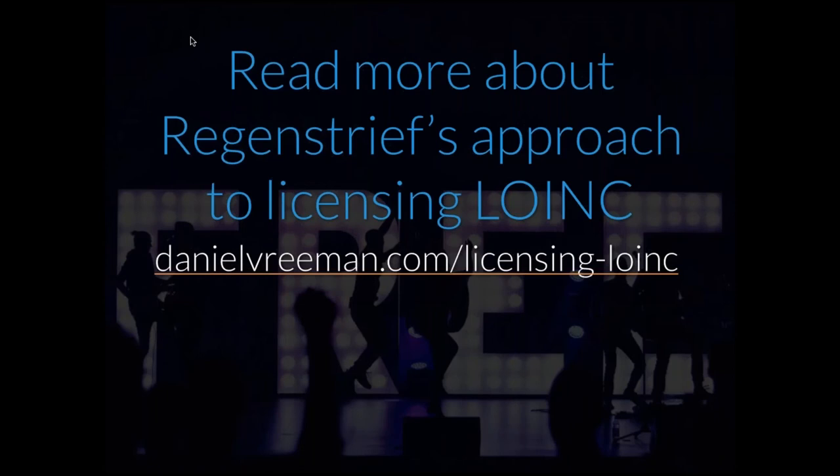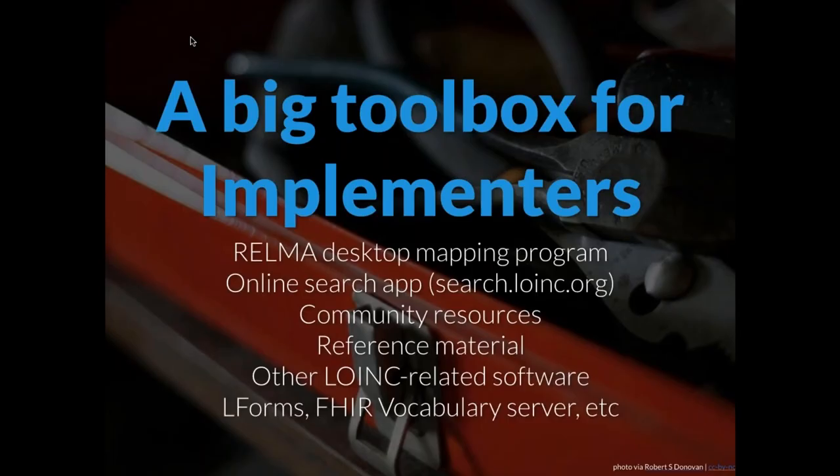In addition to the table and accessory files, there's a huge toolbox of resources available for implementers. Today's focus, for the rest of today, is going to be on the RELMA mapping program and how to use it. It's custom made for the job of linking local terms to LOINC codes and has workflow built into that. But there's actually a whole set of other tools that you should be aware of as well.